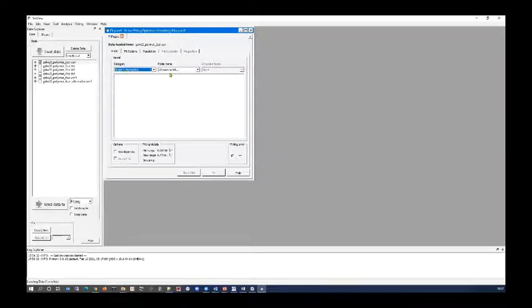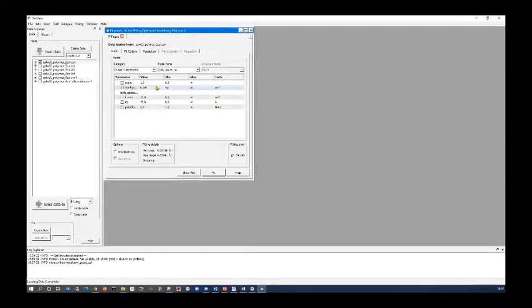So I'm going to go into shape independent, and then here's the list of models that is actually available under the shape independent category. You saw these earlier when I showed you the website and the list of models. There are 2 Gaussian coil models in here. There's one for monodisperse polymers and there's one for polydisperse polymers. So I'm going to choose the polydisperse, and up come the parameters for this model. Now, I actually have a little bit of a priori information here, and that is that I know the polydispersity of this polymer is 1.09. So I'm going to set that.